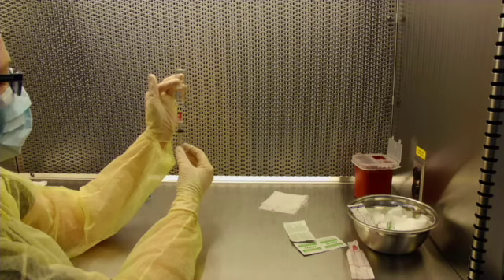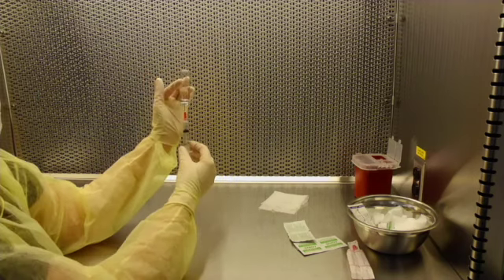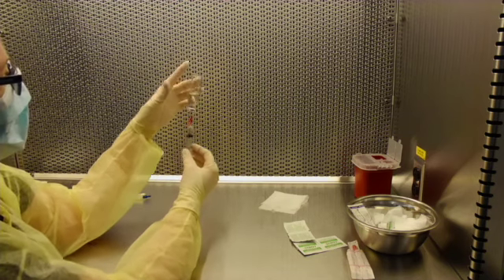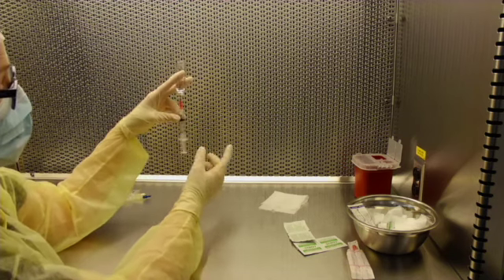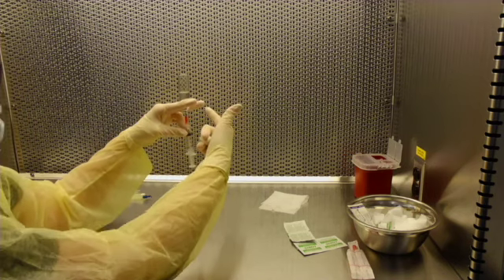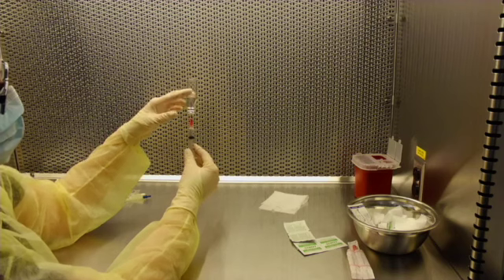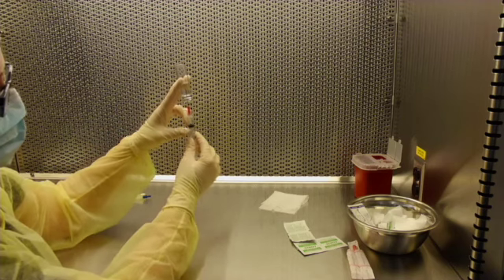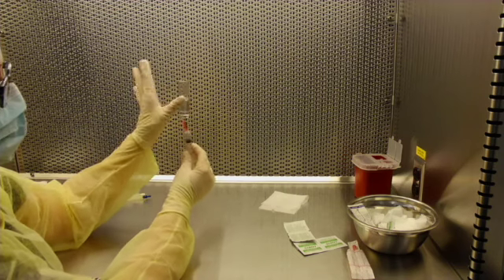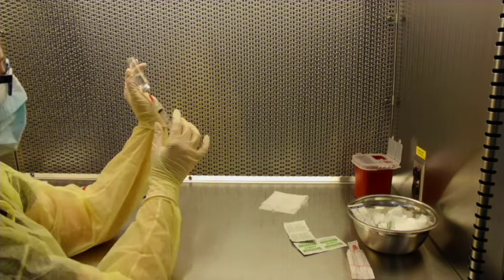Invert your vial and watch for the airflow. See how you notice the hand is now blocking? Keep your wrist twisted. A lot of times it's just in the motion of your wrist. You could hold it between your index finger and your middle finger, but avoid holding it around the aluminum seal, since you can see the air doesn't actually reach the rubber septum. Just watch for a couple different methods on how to hold.